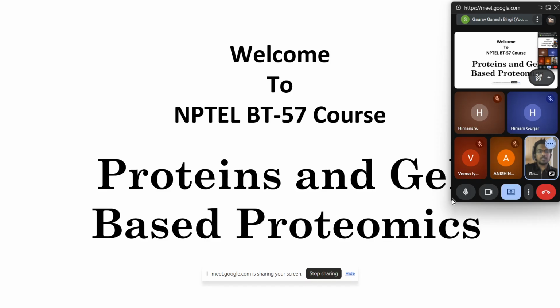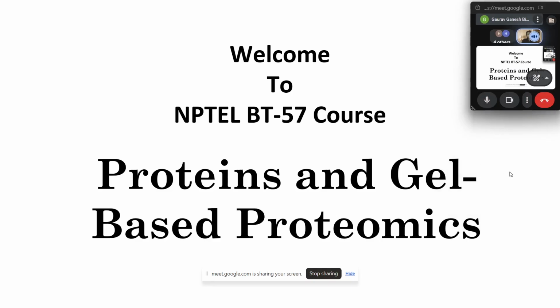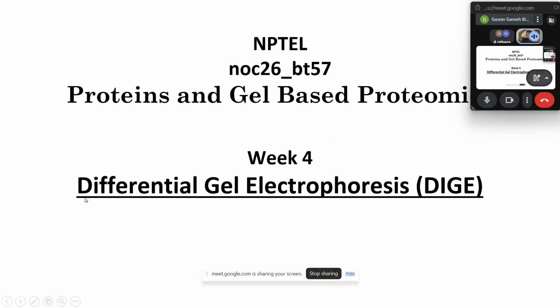Good evening and welcome to the NPTEL course of Proteins and Gel-Based Proteomics. This specific course has a code of BT57 and this is the week 4 lecture. We have already done 3 weeks of lectures. In week 4 we'll basically be dealing with differential gel electrophoresis, that is specifically the DIGE technique, and we'll also be dealing with mass spectrometry a bit.